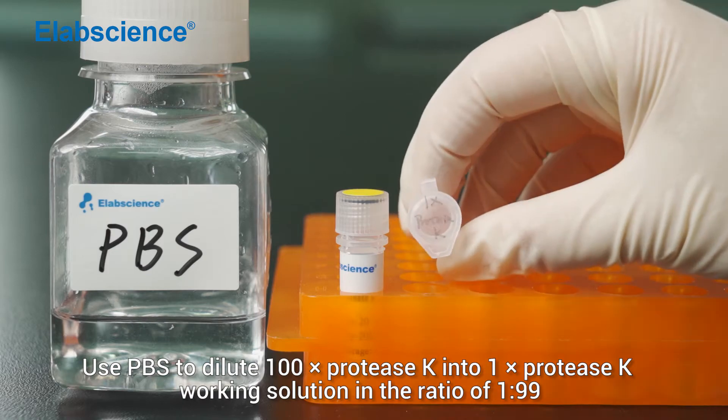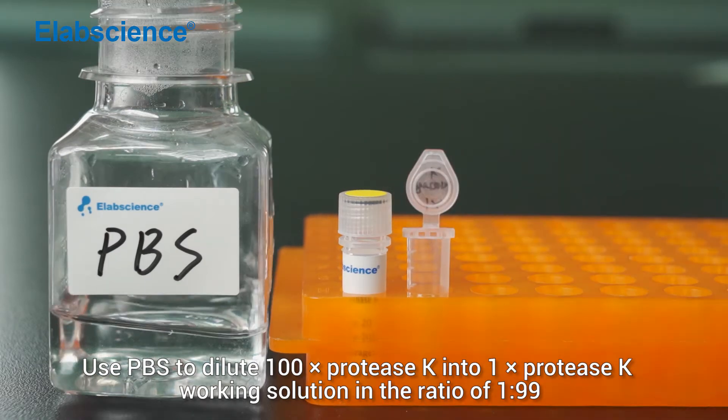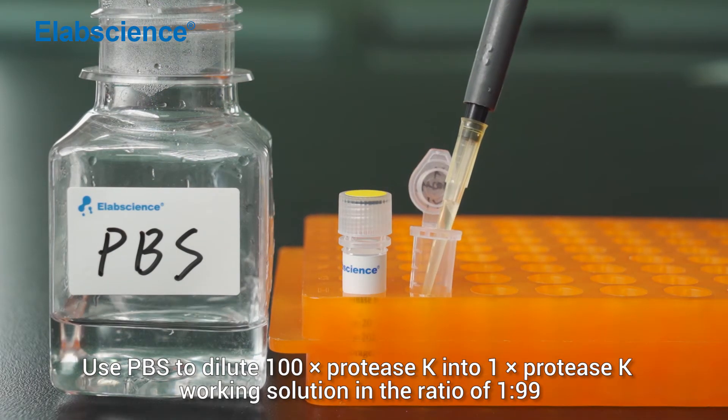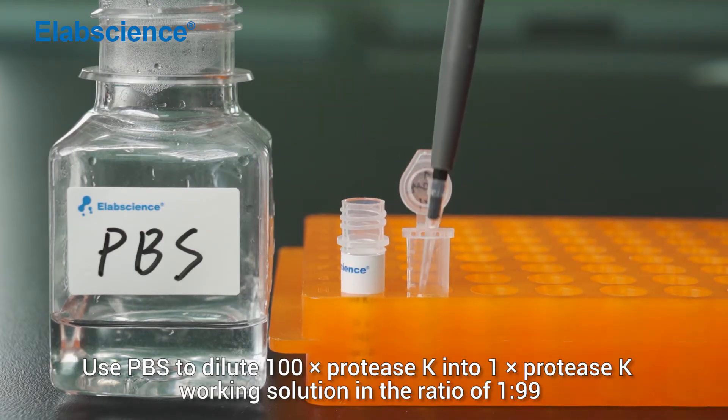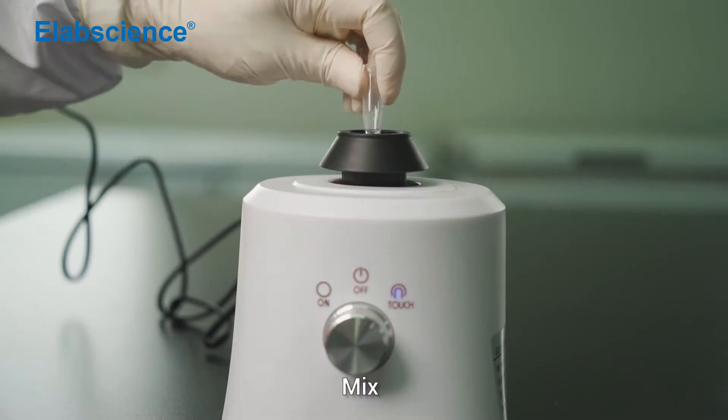Use PBS to dilute 100x protease K into 1x protease K working solution in the ratio of 1 to 99. Mix.